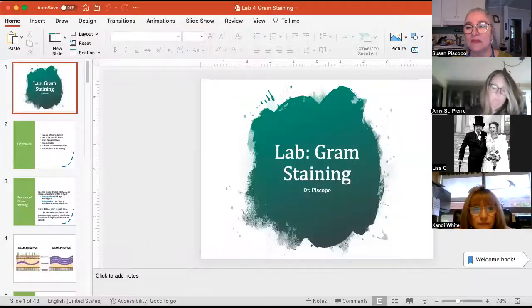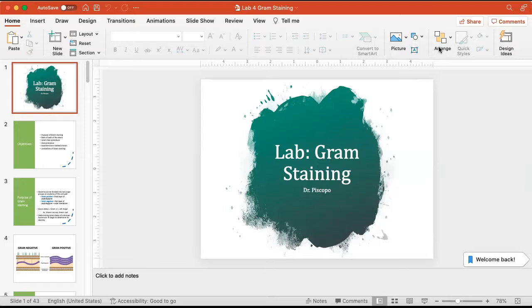All right, I'm going to go ahead and pull our slides up for today. That's what you should be seeing on your screen right now. You should see the title slide that says Lab Gram Staining.